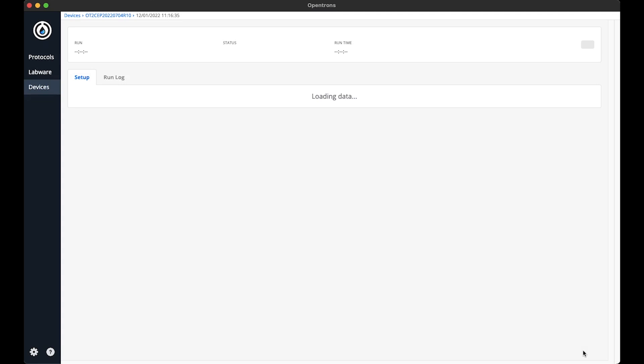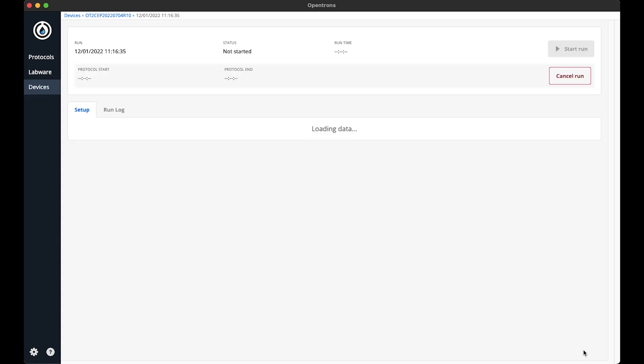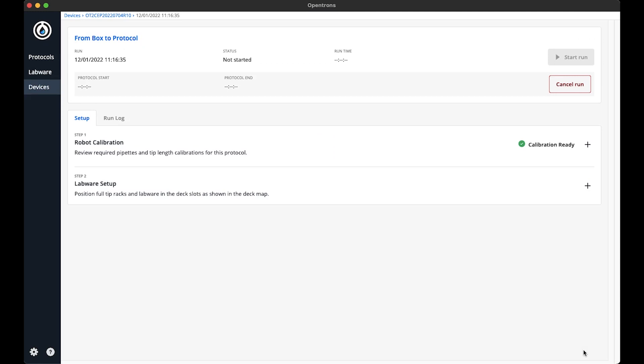This brings me to the protocol setup page, which gives me information on the protocol I imported. If you have been following along, you already know I completed the robot calibrations needed for a run. So there is no need to redo step one. There would be a yellow warning here saying calibration needed if the calibrations were not done.